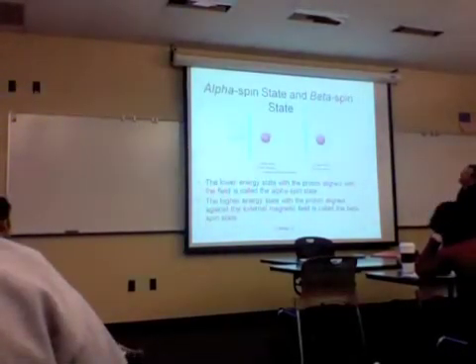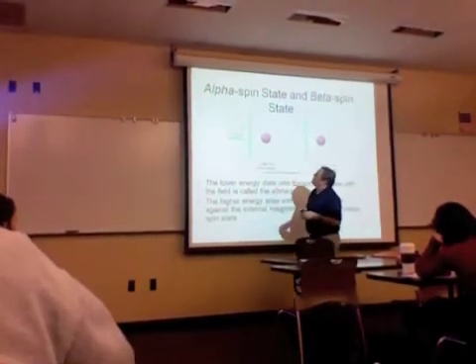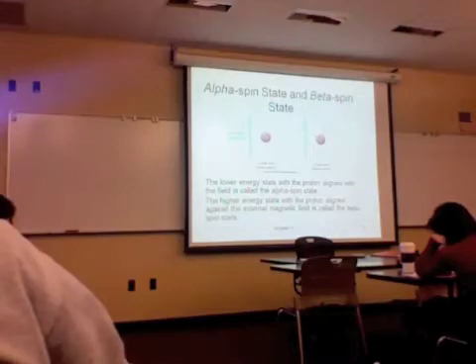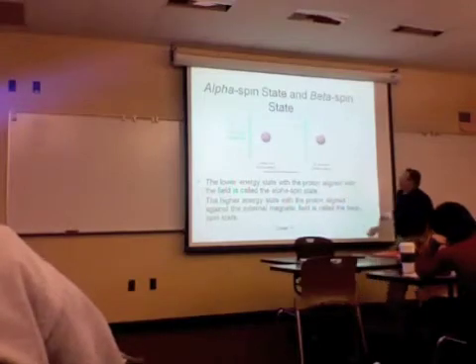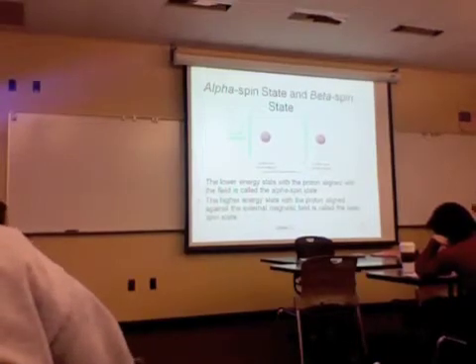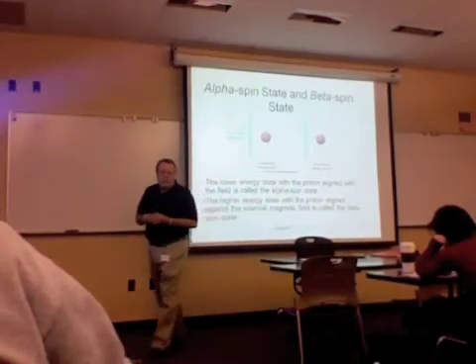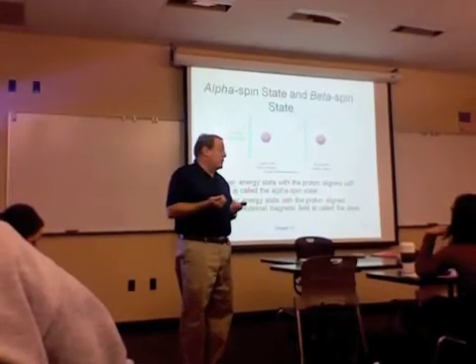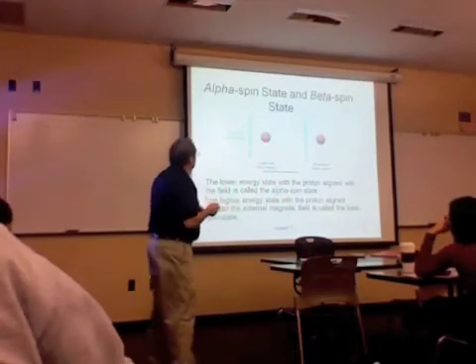Here this is correctly labeled. Here's our applied magnetic field, and you can see that our nucleus is spinning or precessing in harmony or in sync with the applied field. Here, it's opposed. That's not too complicated, right? The difference in energy between these two spin states is very small. And so what we'll end up doing is striking those nuclei with electromagnetic radiation of very low energy, and they'll start to resonate back and forth between the two states. But it has to be the right energy.